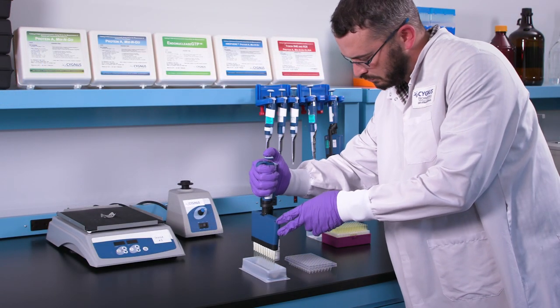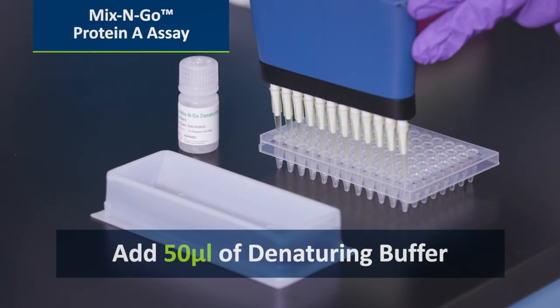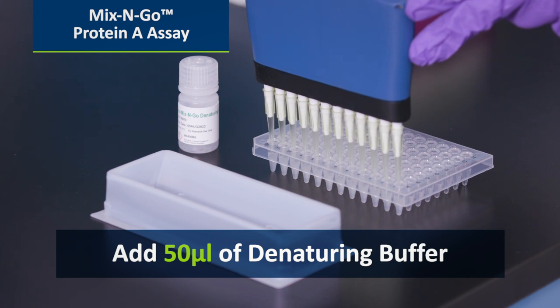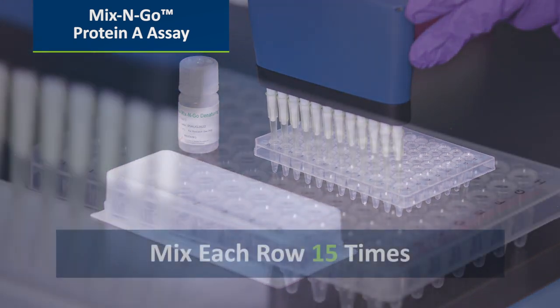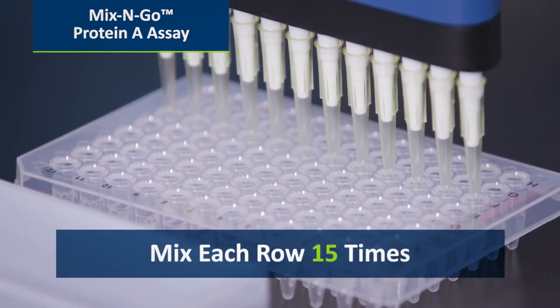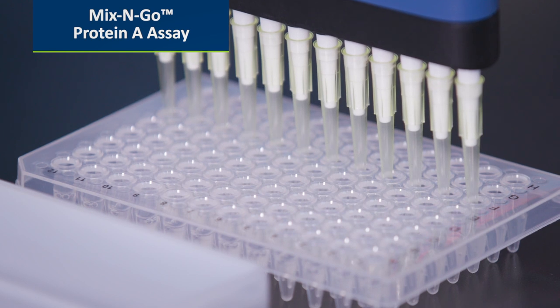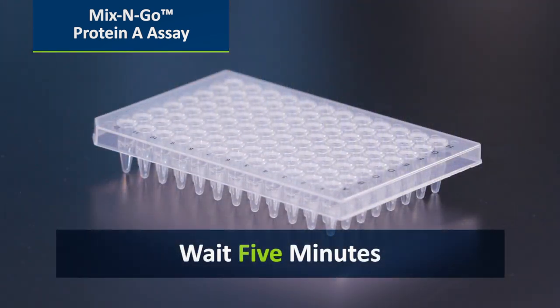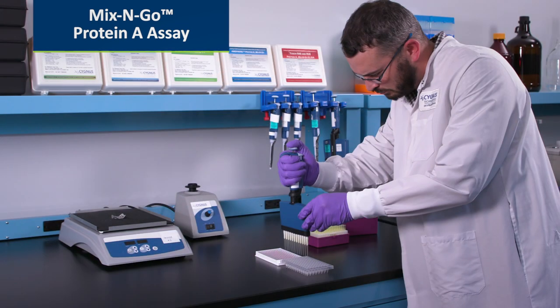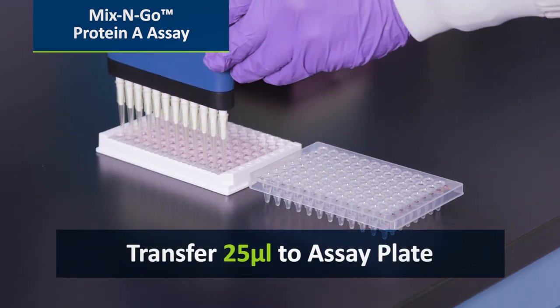For a mix-and-go protein A assay, add 50 microliters of denaturing buffer, and mix each row 15 times. When finished, wait 5 minutes, and then transfer 25 microliters to the assay plate.